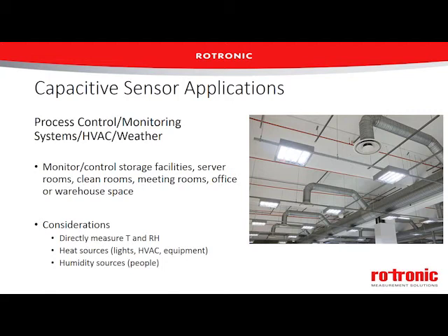So again, very versatile, probably the most common, but as Michael mentioned, the important thing to know is that a capacitive sensor is measuring the property of relative humidity. So this is where temperature comes in. You should know what technology your instrument is using, and if it's a capacitive sensor, make sure you pay attention to the potential problems with temperature variations that Michael talked about in the temperature effects section.